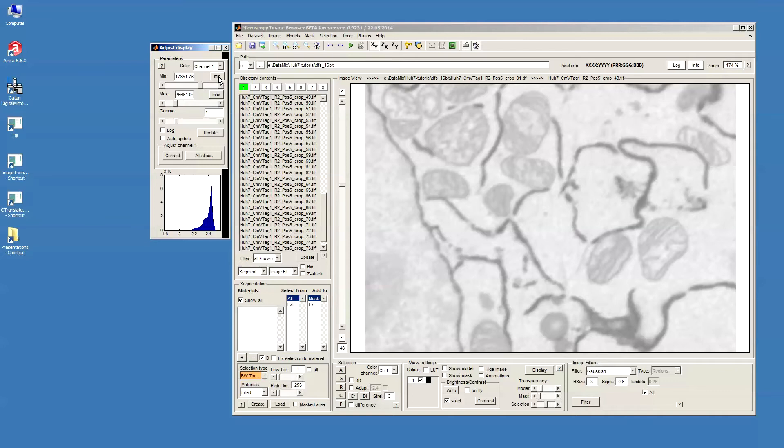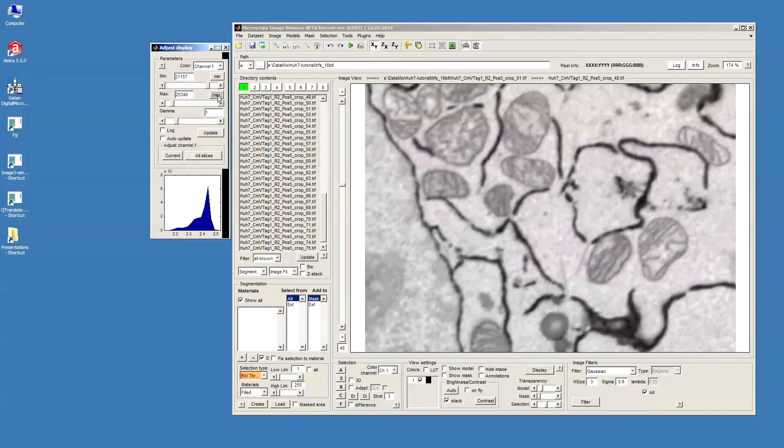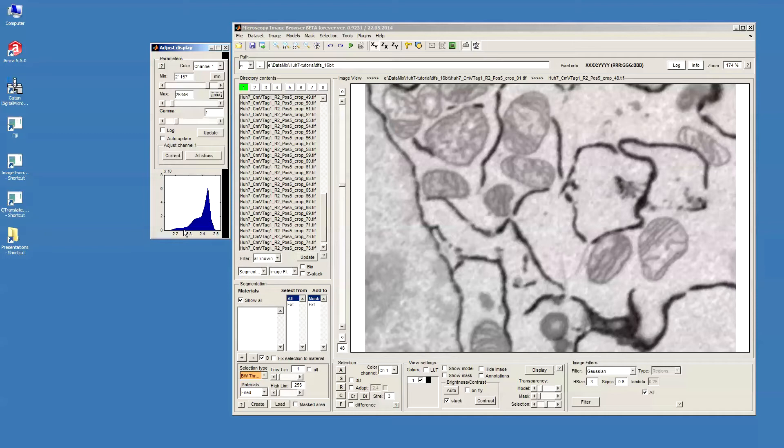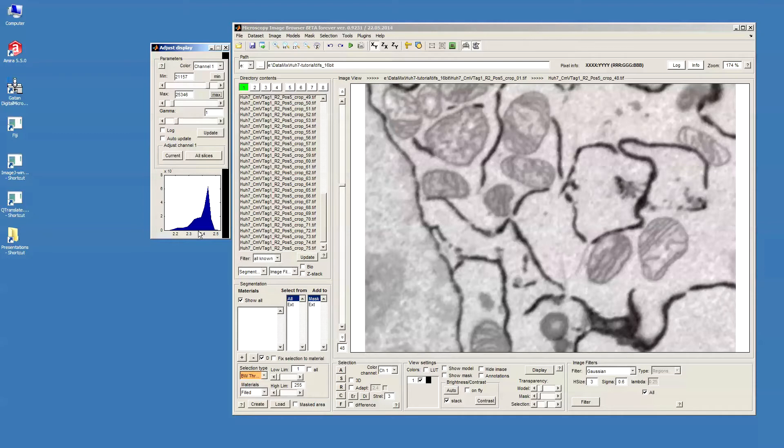Alternatively, we can just click on this min and max button and in this case the minimum and maximum intensity points for the whole dataset will be found and the data will be stretched to this value. What I would like to do is convert the data to 8-bit because it will decrease twice the space that data occupies in memory and also will make some things much faster.